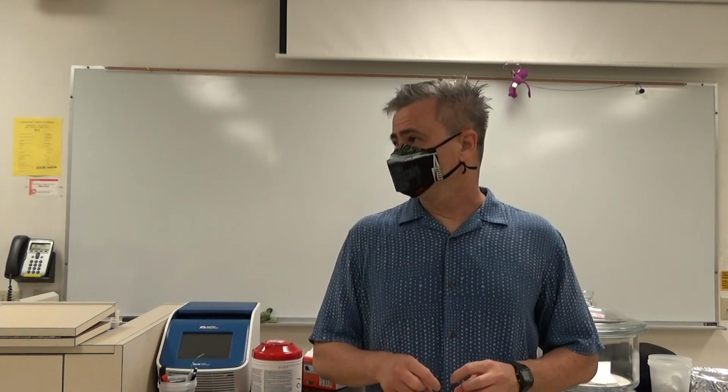So you're going to be building molecules in ChemSketch, and then you're going to be using Chem3D to minimize those structures. What that means is it'll start twisting angles, twisting dihedral angles, and looking for, okay, what's the lowest energy conformation? Is it staggered? Is it eclipsed? Is it staggered anti? Is it staggered gauche? Those types of things. Does all that stuff sound familiar? Yeah, from chapter 4. Okay, so that's what you're going to do.